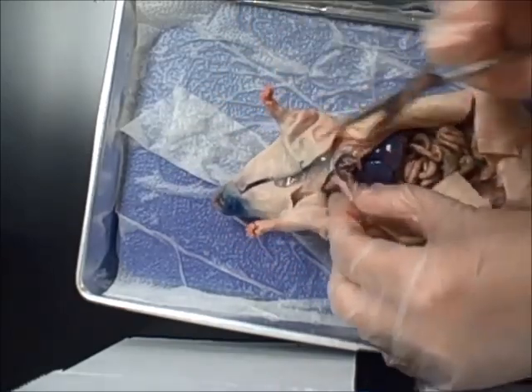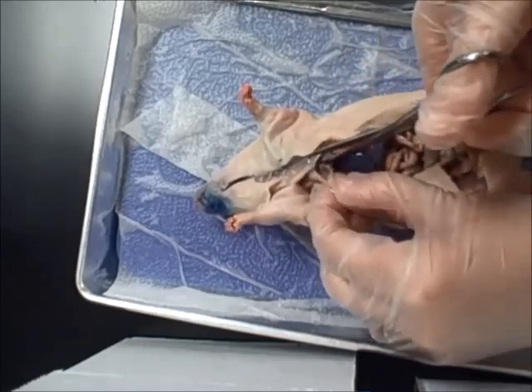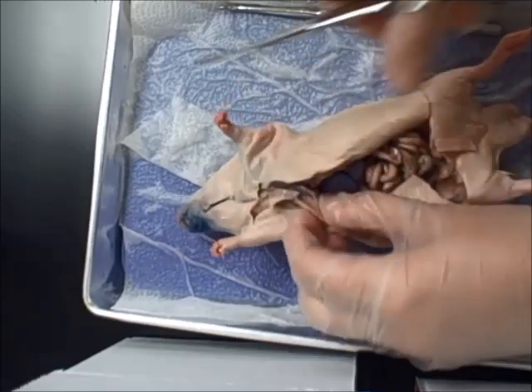What I'm going to do now is cut through the sternum. Sternum is the breastbone and the ribs, so we can open up the thoracic cavity.